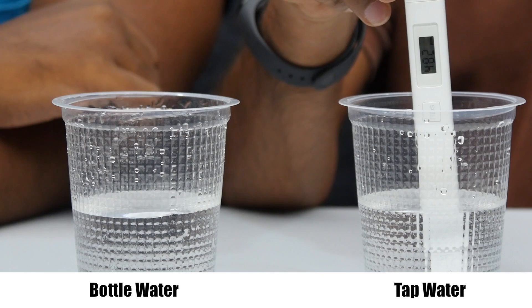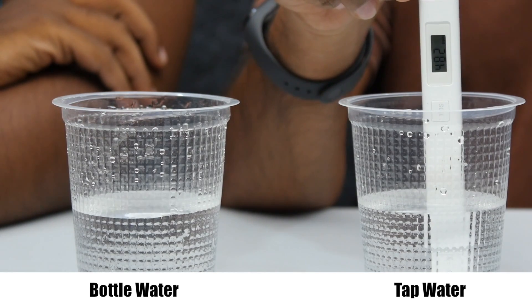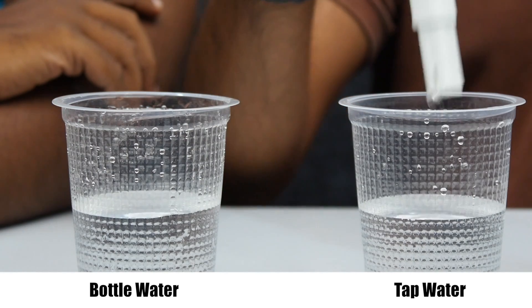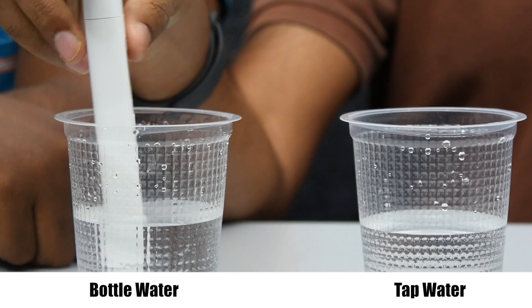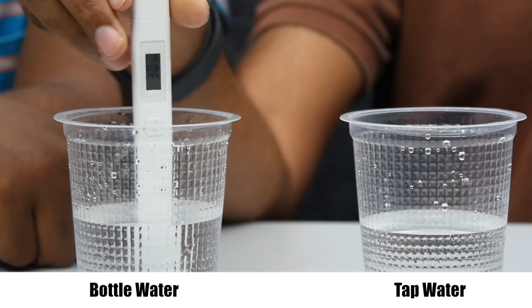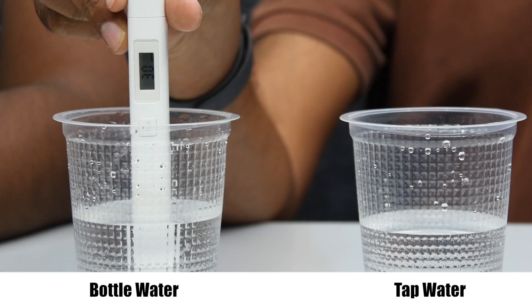The recommended Indian standard is 500 PPM, so tap water at 485 PPM can be used for consumption. There is about a 3-second delay for the reading to stabilize. Now let's test the Bisleri water — the reading shows 30 PPM.